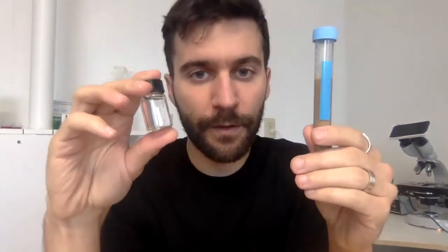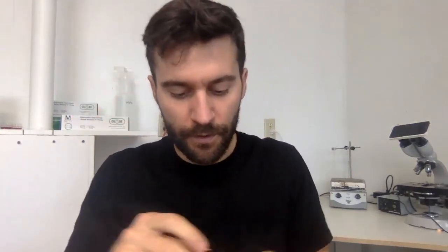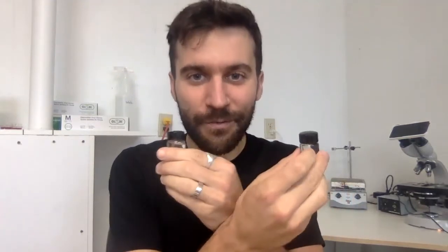To dilute, like I said, we take a small sample, a milliliter, and add it to 9 mils of water. So it's a 1:9 ratio. We switch this around and do the same thing to the next one: take a milliliter of this, add it to this one, switch it around, and then do it again to this one. These are all approximately 9 mils. And at the end, we'll have this final dilution, much less concentrated, diluted 1,000 times.